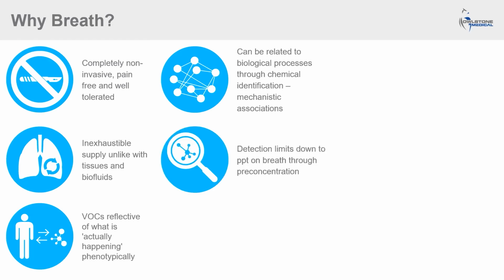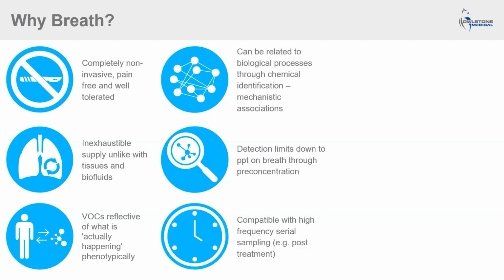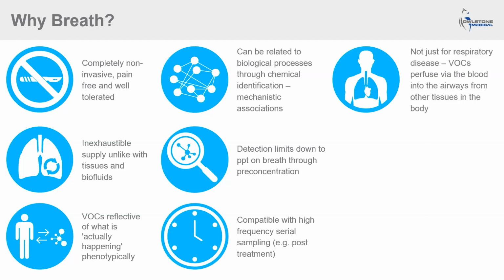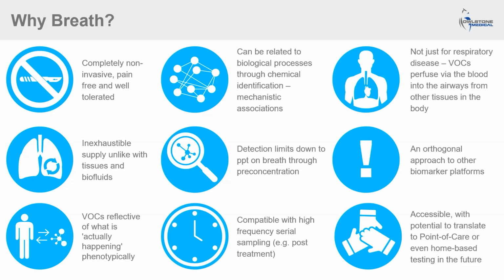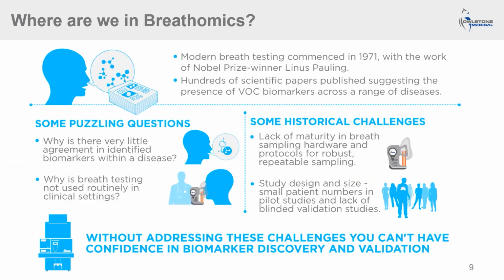Our process allows for pre-concentration, so detection limits are in the parts per trillion range. This is particularly important in early detection where potential biomarkers are likely to be low abundance. Since it's non-invasive, high-frequency serial sampling is possible with no ethical or patient comfort concerns. As I mentioned earlier, breath is for more than just respiratory disease. Breath could also be used as an orthogonal approach to other biomarker platforms. And lastly, because breath is so easily accessible, there is the potential to translate to point-of-care or even home-based testing in the future.